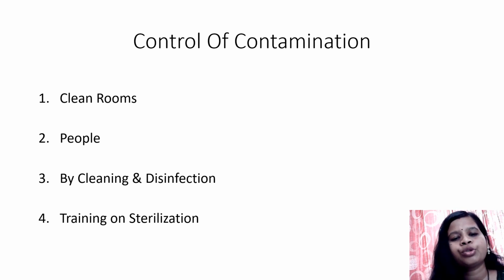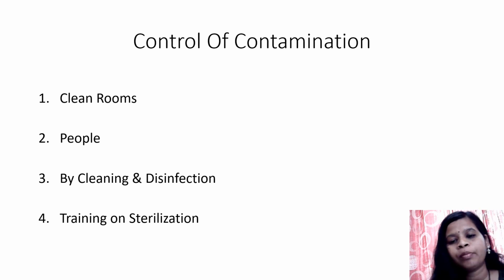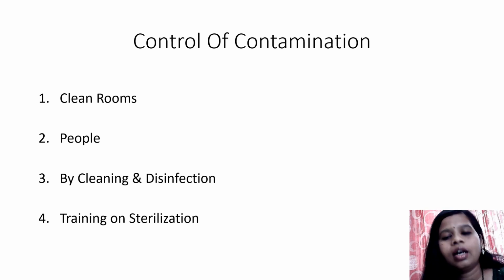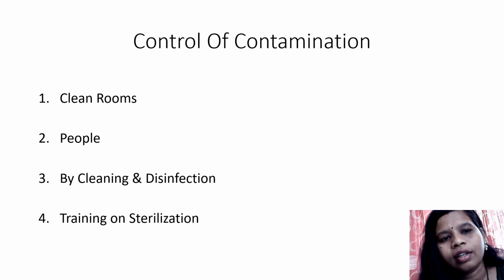Sterilized material should be stored separately so that it does not go through the procedure once again, because sometimes although we have sterilized and kept it with the non-sterile products, it may get contaminated or may not remain sterile due to the other material. So we have to avoid such things to have control over the contamination. Thank you.